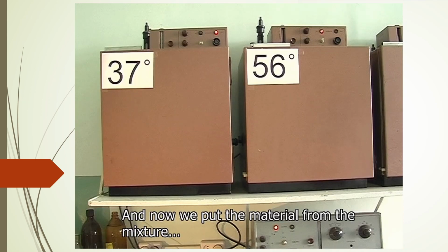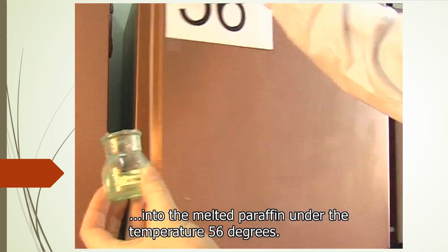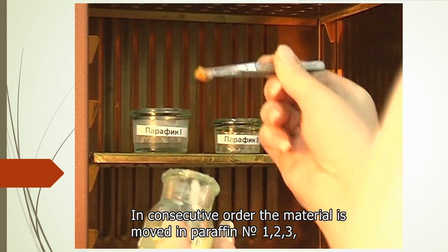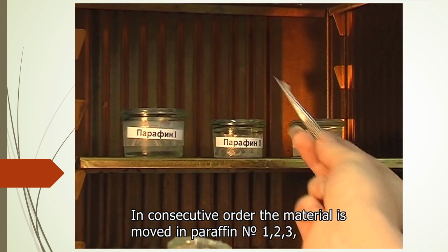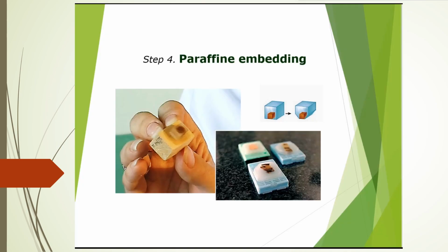And now we put the material from the mixture into melted paraffin at a temperature of 56 degrees. In consecutive order the material is moved into paraffin number 1, 2, 3, for 1 hour in every portion.